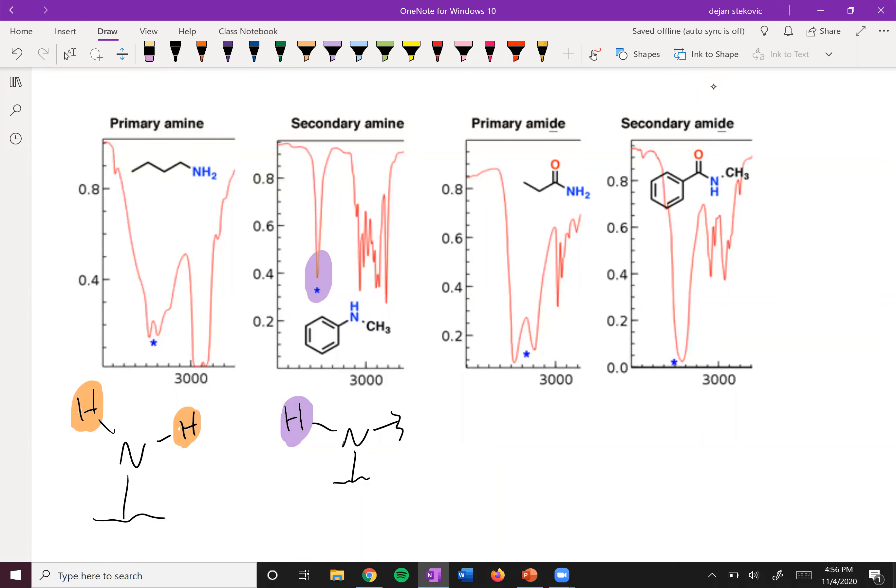You can see this one overall does look quite a bit like an alcohol, and so there is some difficulty there distinguishing.